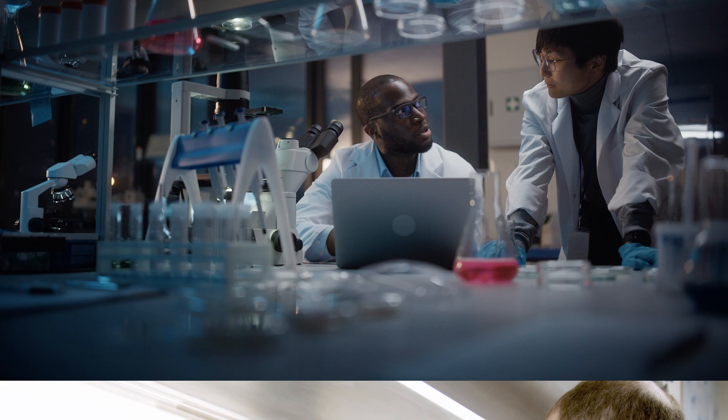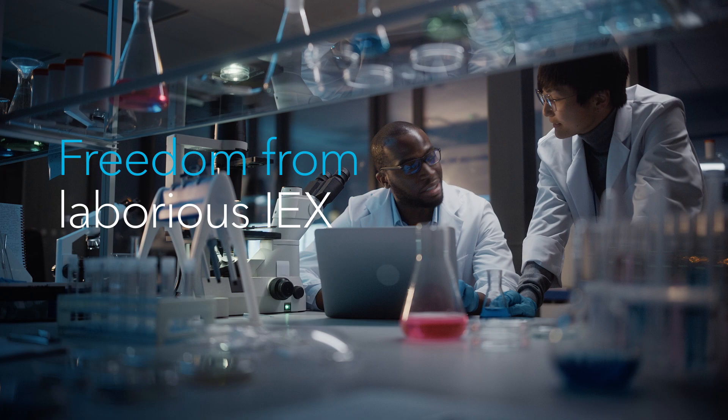Just imagine, no more weeks or months of work for IEX-based fractionation methods. Get away from laborious bridging studies. The best part? You can analyze the charge heterogeneity of your molecules and collect them for characterization on the same instrument in the same day.